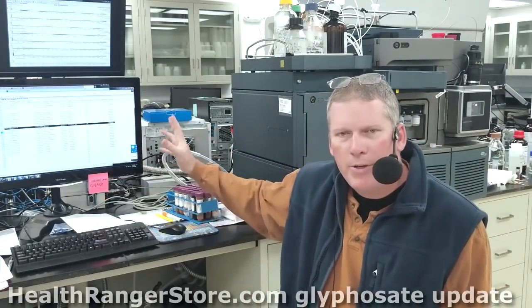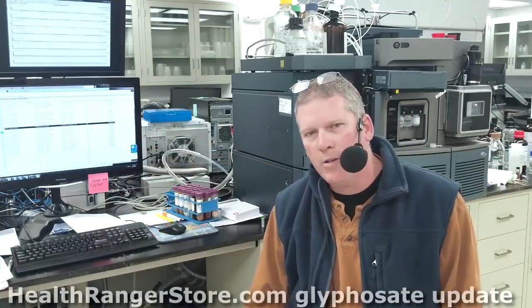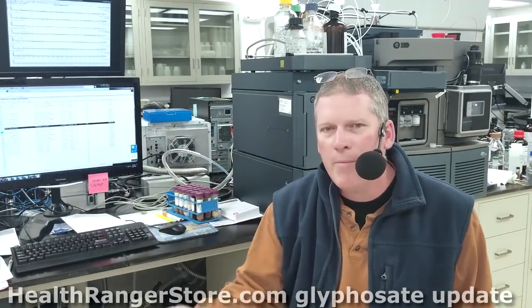So I do this myself. I run the software. I do the chemistry. I do sample extraction. I mean, I've got help, but I design the method, and then I teach others to do the extraction and help us achieve the volume that we need to be able to test everything. But I do the analysis. I look at the chromatography. I build the method. I look at the linearity of the curve. I go through the chemistry calculations to back calculate the number of picograms of the target analyte in the original food sample. I do all that myself, so I know exactly what's going on.